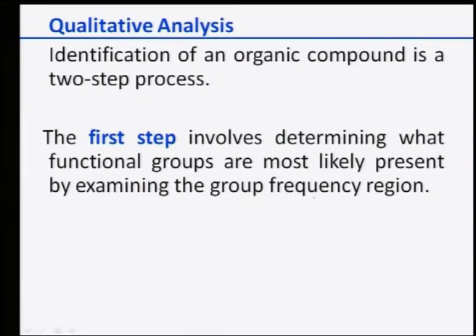FTIR is used to do both quantitative and qualitative data analysis. First we will discuss the qualitative analysis, what all qualitative things we can do. This is used mostly for identifying different kinds of organic compounds, but it can also be used for inorganic compounds, which I will show at the end of my lecture today.